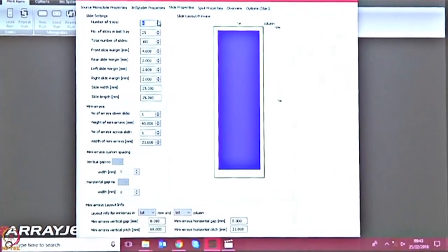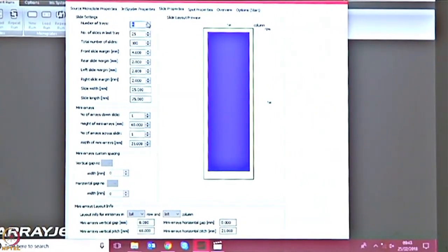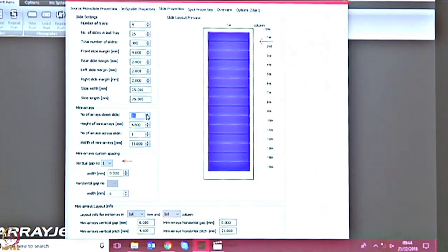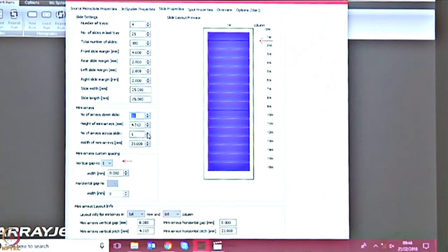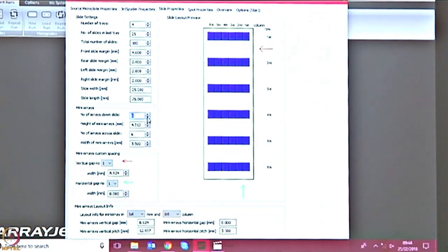Now, somebody give me a normal number. How many pads? Or let's take an ELISA. Let's take 96. So what I'm going to do is divide this full slide into 96 squares with the software. I'm showing it this because I want to show you the difference in the pitches. So let me give you a 6x6 example and increase the space for the purposes of explaining. I think that will be better. So with the help of a software, I'm changing how I want my assay to look.